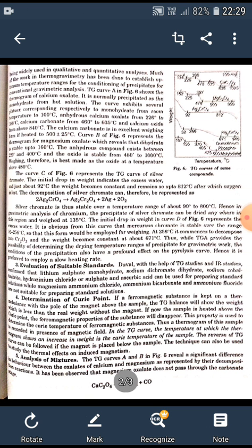be determined. The thermal stability of EDTA and its disodium salt has been reported by Wendland. He showed that the dehydration of disodium salt commences between 110 degrees centigrade and 125 degrees centigrade, and it could be safely heated to a constant weight at 80 degrees centigrade. The second application of thermogravimetric analysis is in the determination of correct drying temperature.